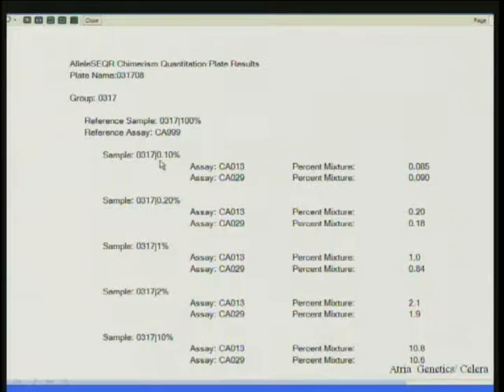This is again another readout that we got from the company, a slide from the company, where they're looking at input DNA based on their own calculations, two different markers that were used in the assay, and then what the program calculates for you as being the percentage of this minor component in the mix. As you can see, the two markers give you pretty close results, and the results are very similar to what was calculated as being should be there. And again, the nifty thing about this program is that it's a click of a button. You run the program and you hit calculate, and it basically does it for you and spits out the result, which is very attractive since the STR analysis can be so cumbersome.